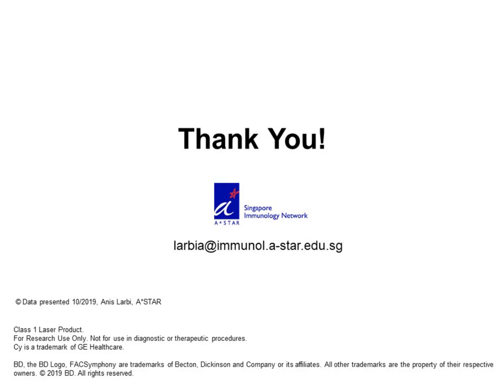Thank you. Given that there is such a high density of new biomarkers that can be tested at once nowadays, how can a user be certain that the fluorescent level of the biomarkers tested is a real positive and not just due to high background? Yeah, obviously, when you end up with so many markers, you want to ensure that the signal is real.